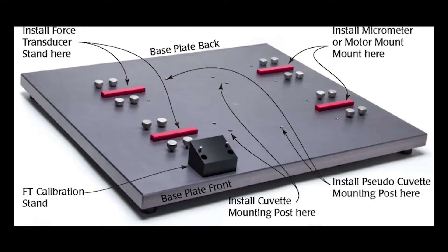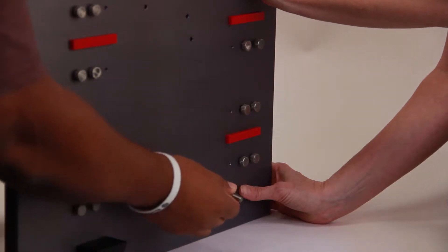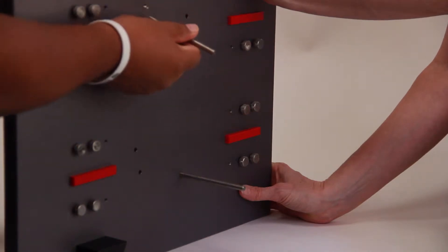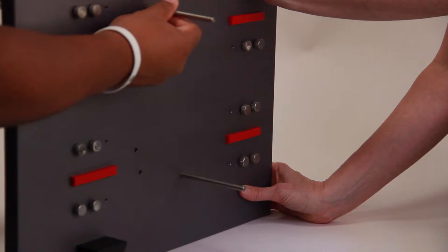Position the base with the force transducer calibration stand in the front. Tilt the base plate up and let a friend hold it in place. Then insert a screw from the back side of the base plate into one of the pseudo-cuvette mounting post holes. Screw the mounting post into position and tighten it with a hex key. Install the second mounting post in the same manner.